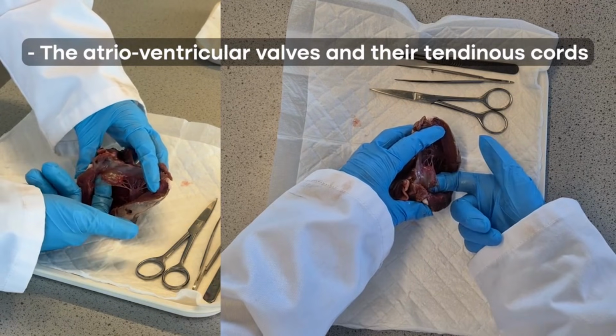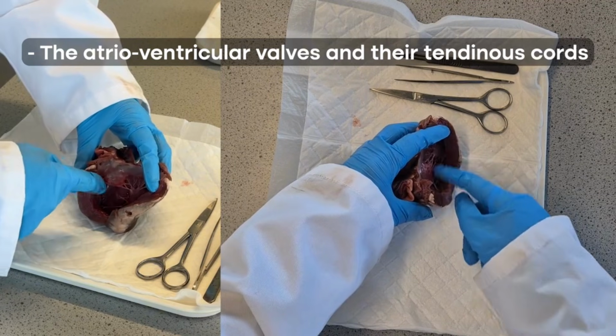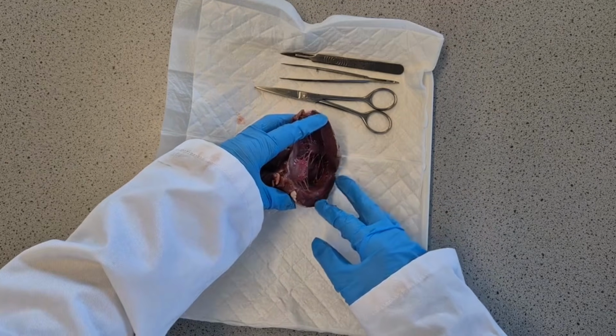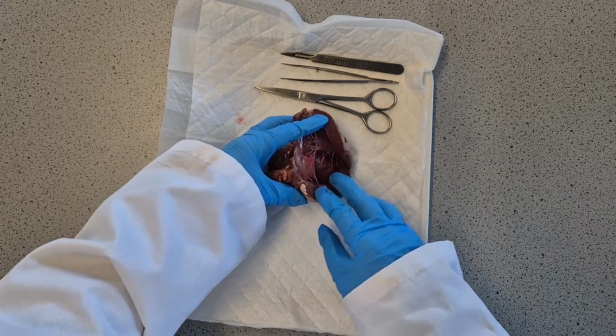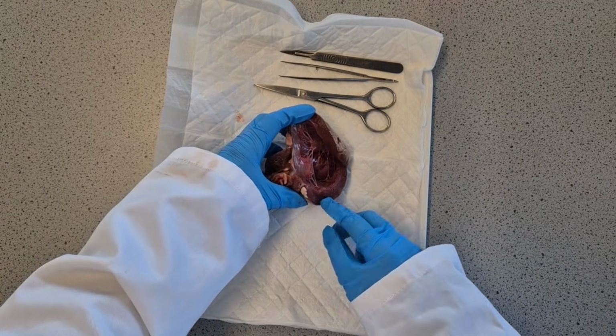And the tendons here are connecting the atrioventricular valve to the ventricle wall. So you can see that valve really nicely there. I'd get the students to hold it out. You can use your mounted needle to pin it down. I'd get them to take a photo at that point so they can see that structure really, really clearly.